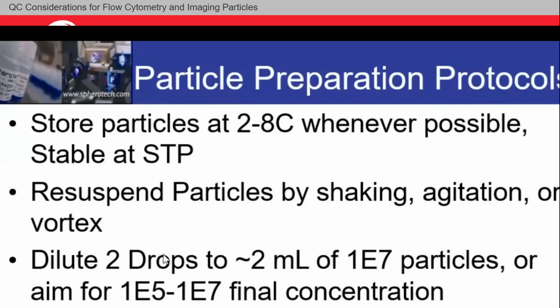If you are running them very, very fast, you could run them at much more robust speeds, but you usually don't need to be running them as aggressively as some people do, although it can be great for high throughput. You can get a lot more work done in an individual day. But when you're running the rainbow calibration beads or setting up your parameters in each channel before you do those faster runs, this is a fantastic, fantastic dilution.